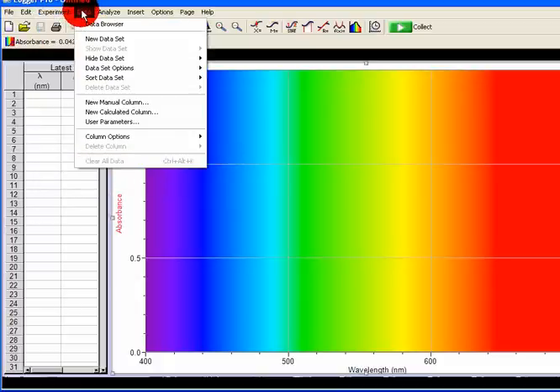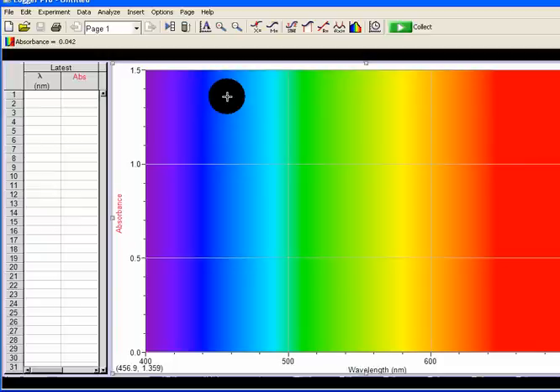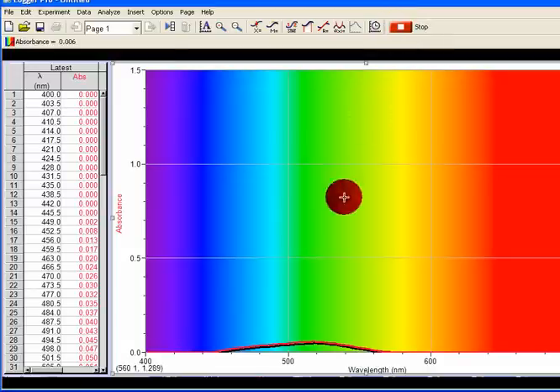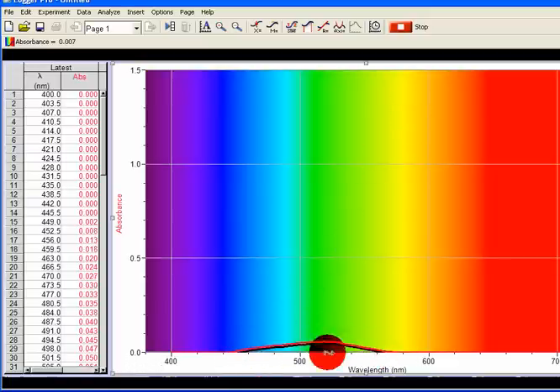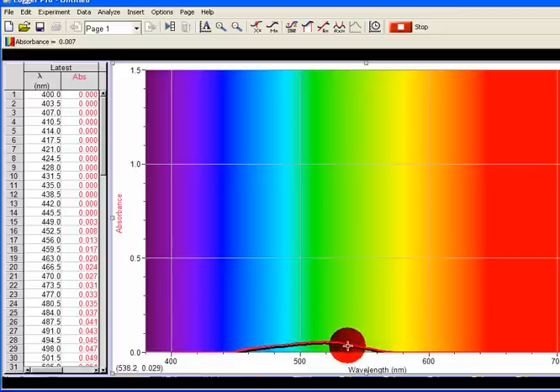This is under Data Collection. So right now I'm going to show you the simple one. I'm going to put in cobalt chloride. I'm going to click on the Collect button — the green button here. So I've added cobalt chloride solution which is red in color. I have a full range spectrum. Because it's red, it's going to allow red light to pass through and going to absorb a lot in this region.